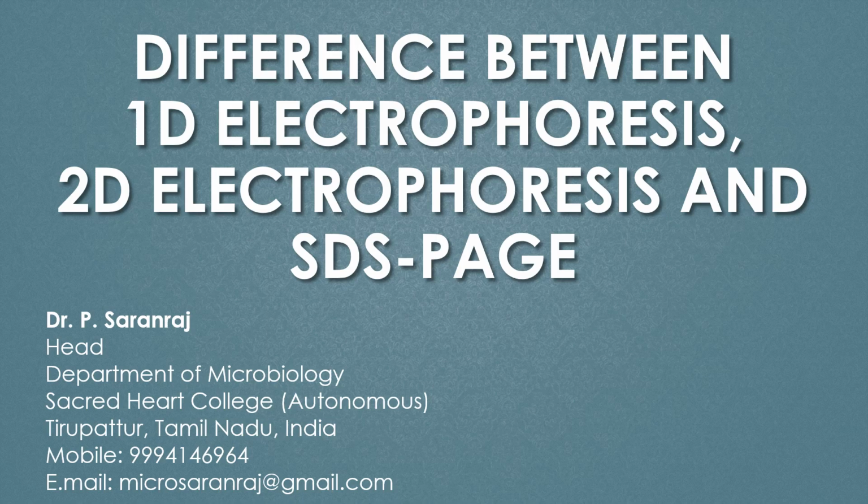Dear viewers, greetings. In this video, we are going to discuss the differences between one-dimensional electrophoresis, two-dimensional electrophoresis, and SDS-PAGE.